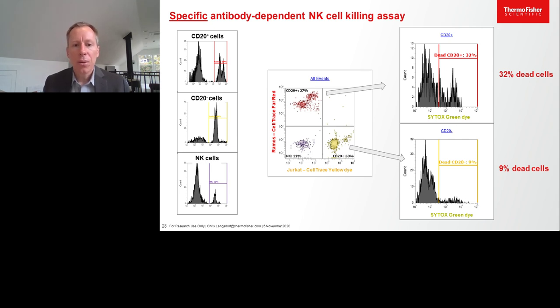However, we thought more about this experiment and realized that the natural killer cells we're using are fresh from a human, just a few hours prior to the assay, while the target and bystander cells in this experiment are from a totally different human. And we're also lacking a lot of components here.